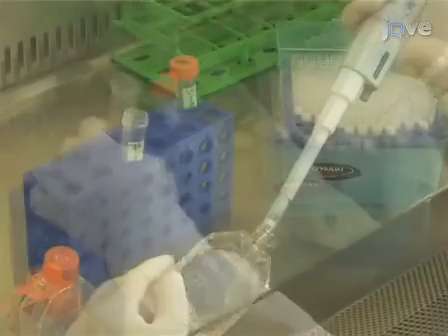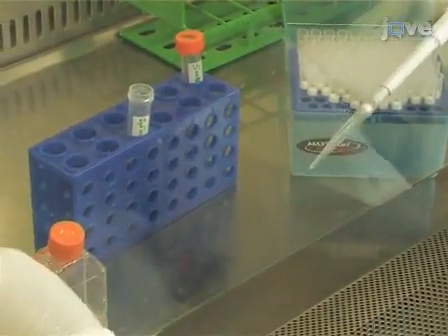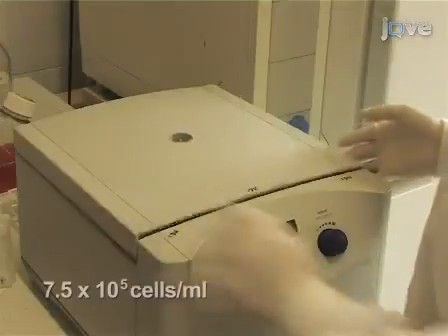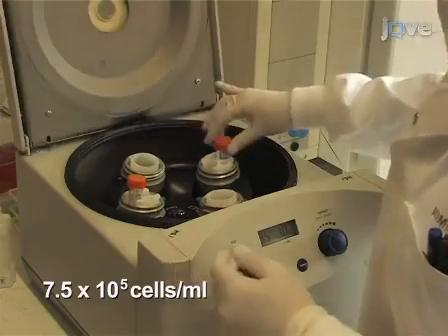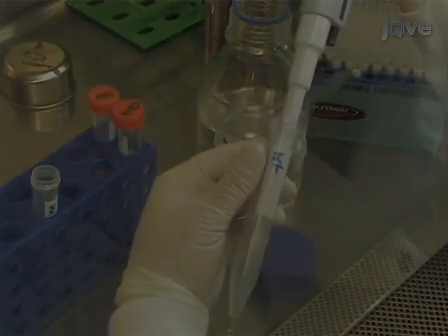Next, add the CldU label to a final concentration of 250 micromolar. Mix and incubate the cell suspension. Now wash the DT40 cells with ice cold PBS and resuspend the cell pellets in cold PBS.